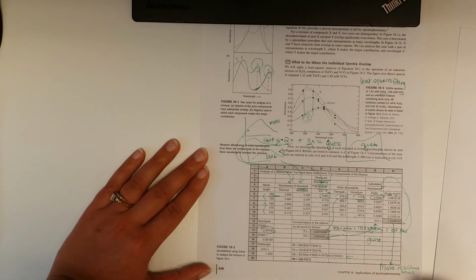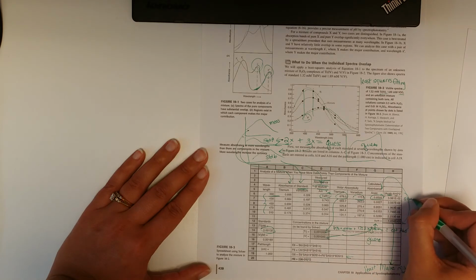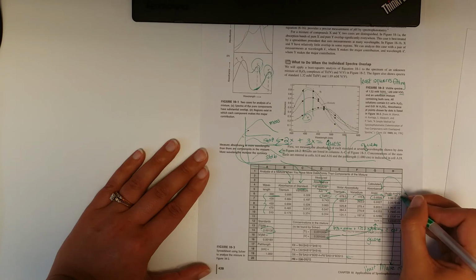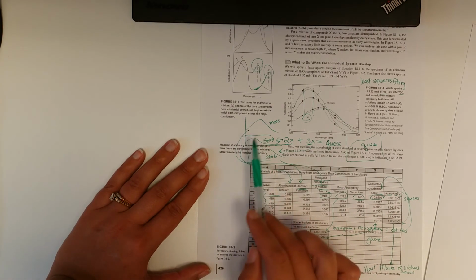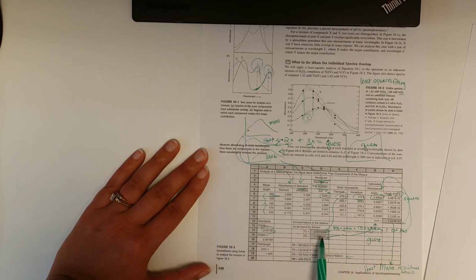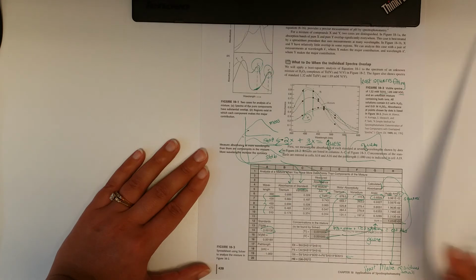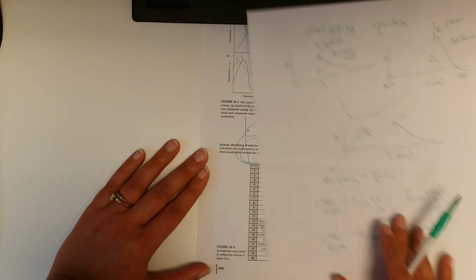Thus it is now least squares from the square. And then the fitting is, the measurement is going to be some combination of this standard plus that standard. I'm going to keep guessing concentrations to fit into this equation. I don't know what this is, I'll guess. I don't know what that is, I'll guess.